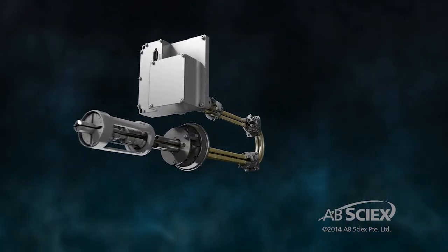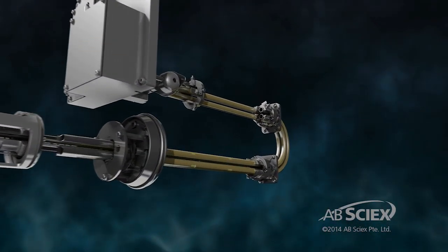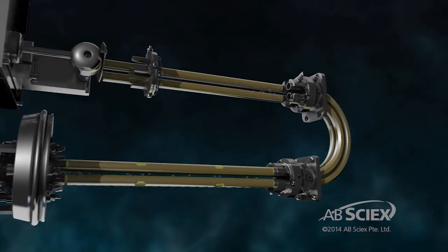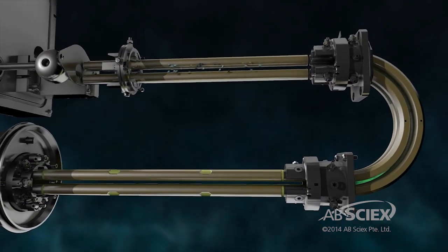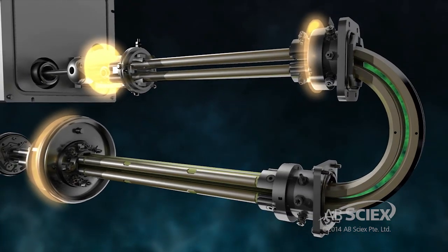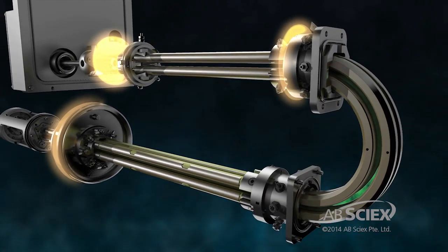The AB SCIEX Q-TRAP system is a hybrid triple quadrupole linear ion trap mass spectrometer. This system offers unique capabilities over and above the basic triple quadrupole instrument that helps solve a number of workflow challenges.